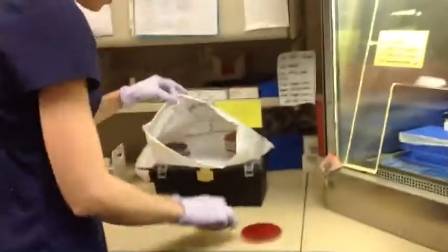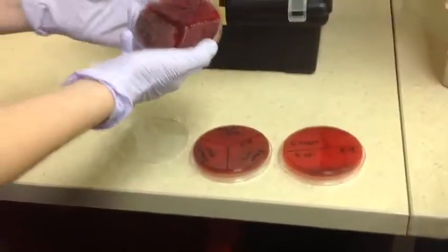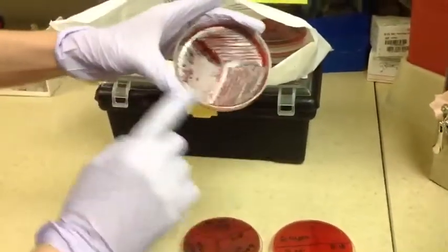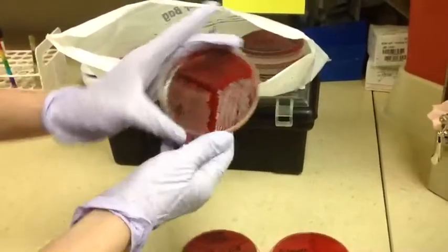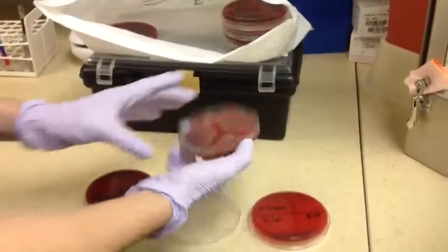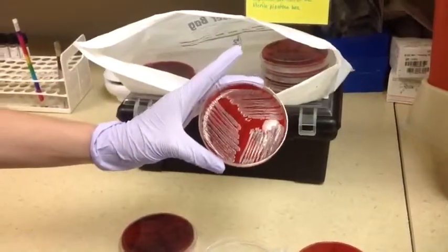Here are some examples of different kinds of bacteria. So this is E. coli up in this top section here. Pseudomonas aeruginosa kind of has a mother of pearl sheen. And then over here we have Klebsiella pneumoniae. Here are some different types of staph aureus that are commonly called staph infections.